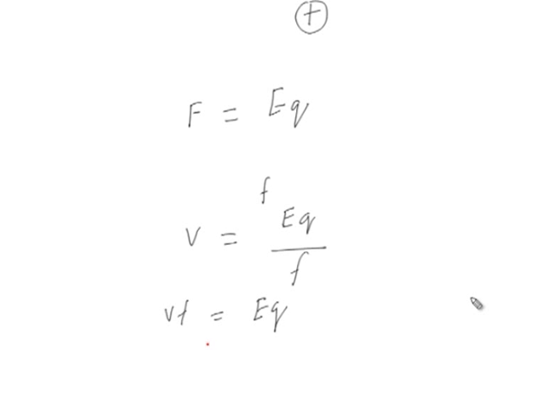After a certain period of time, the forward moving force E q equals the viscous drag, which depends on the velocity of the molecules, that is V F. There is another, more popular term used, which is electrophoretic mobility, and it is given by velocity per unit field, or you can say q upon frictional force. That is the electrophoretic mobility, which is more commonly used.